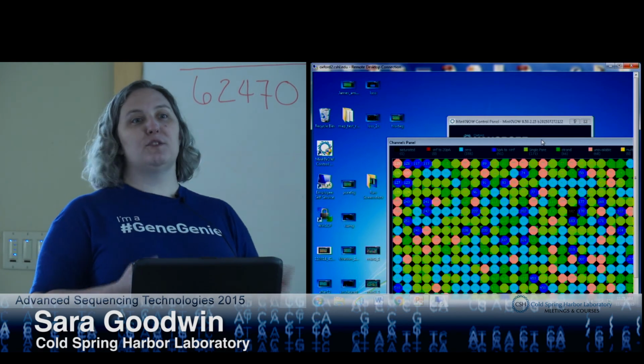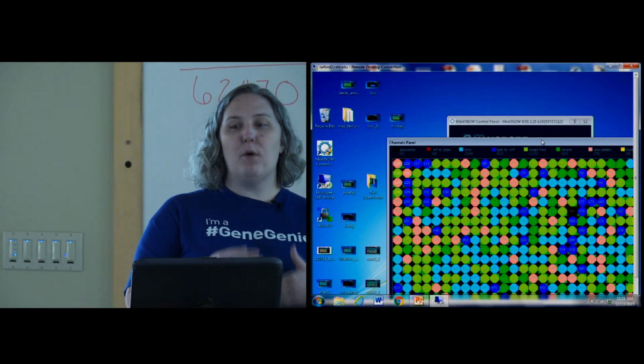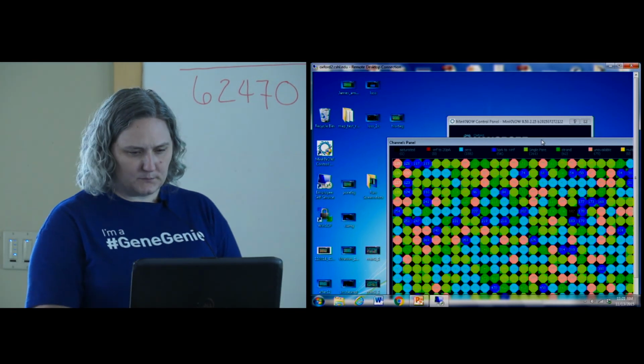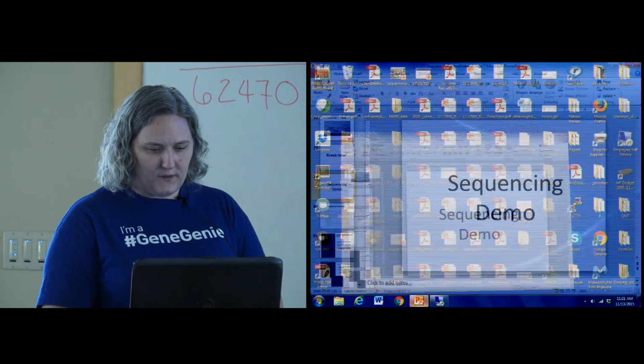And it sorts them based on a Phred score in terms of pass and fail. And within the data structure, there's more information. We'll go over the data structure here shortly. But you can monitor how well your run is performing based on the number of reads that are going into that pass and fail folder. Okay. I'm going to shrink this window down, and we're going to pull this guy back up again.